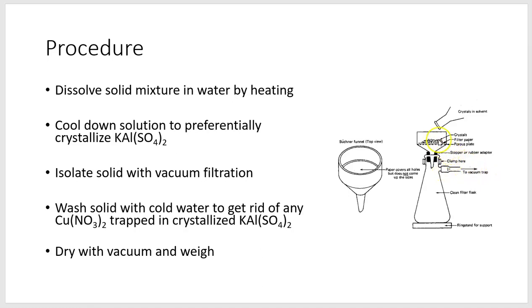We do that because oftentimes the solid can block liquid from going through the filter paper. So to speed up the process, we use a vacuum to pull air and liquid through this funnel. The Buchner funnel is this particular setup that allows us to vacuum filter solid and liquid and separate the liquid from the solid in this manner.